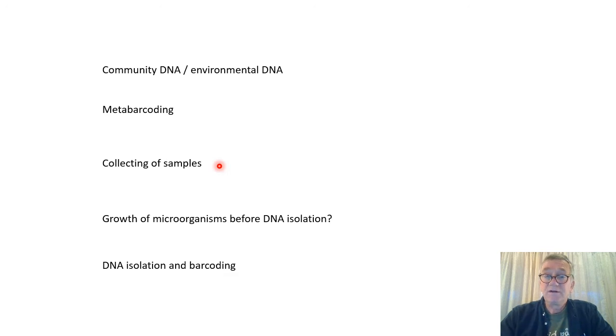The samples for this study, or this lecture, or this laboratory exercise, are just one sample collected from two different environments. One of the environments is compost, that is soil or earth from a compost bin. So that is one sample, and we want to see how many different microorganisms, actually how many different bacteria species are present here.